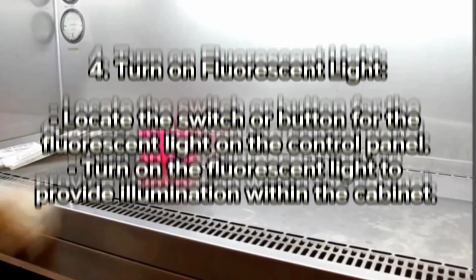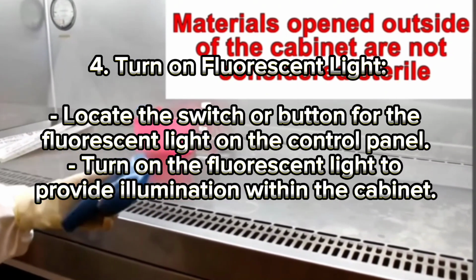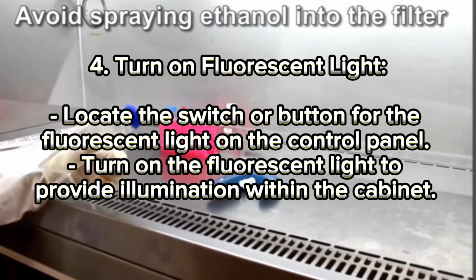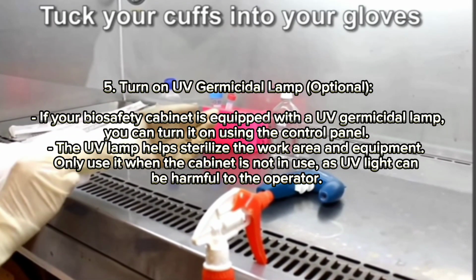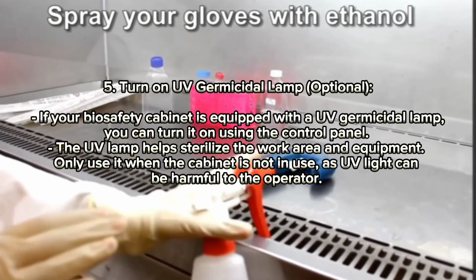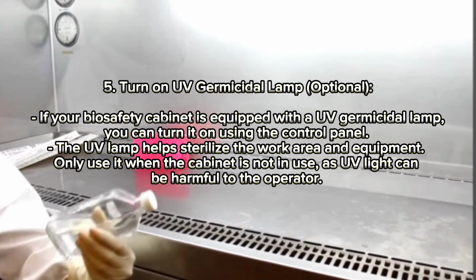Fourth is turn on fluorescent light. Locate the switch or button for the fluorescent light on the control panel. Turn on the fluorescent light to provide illumination within the cabinet. Fifth is turn on UV germicidal lamp. This is optional. If your biosafety cabinet is equipped with a UV germicidal lamp, you can turn it on using the control panel. The UV lamp helps sterilize the work area and equipment. Only use it when the cabinet is not in use, as UV light can be harmful to the operator.